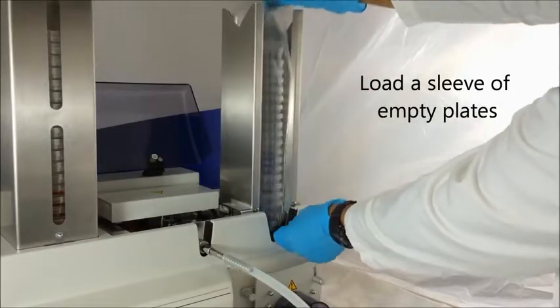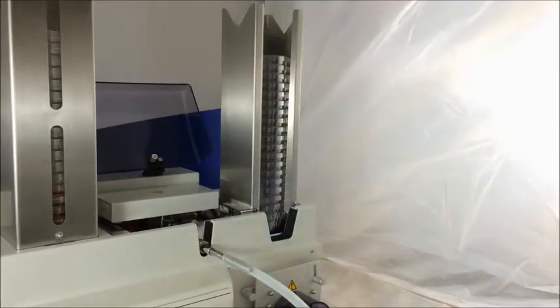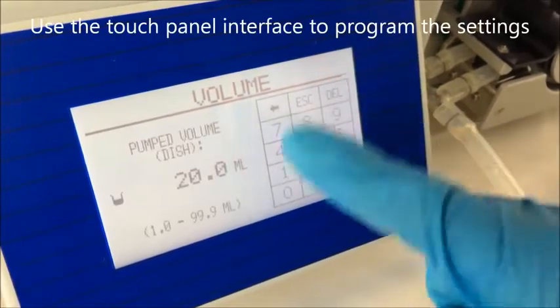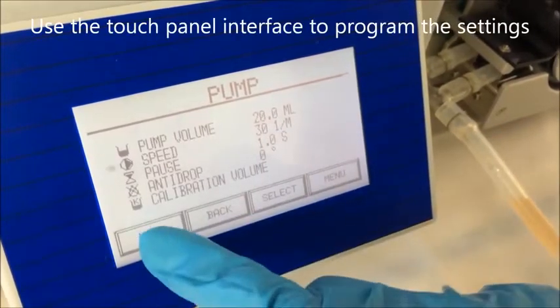Load a sleeve of empty plates into the feed tower. Using the touch panel interface, program the unit with the desired settings.